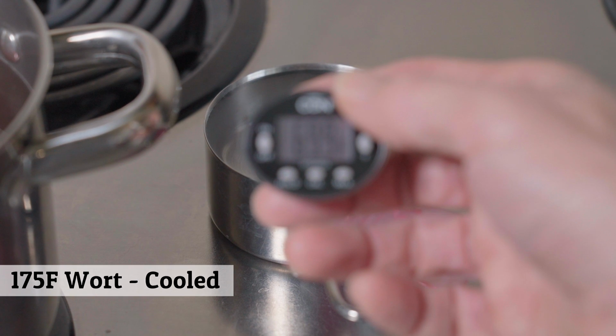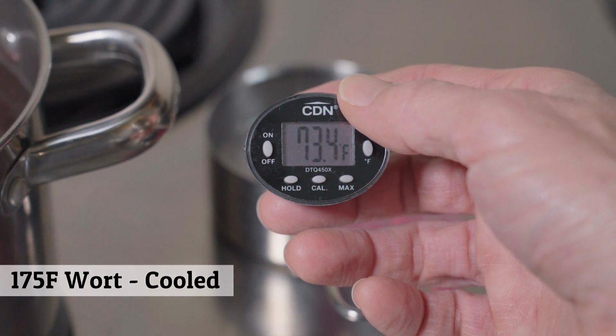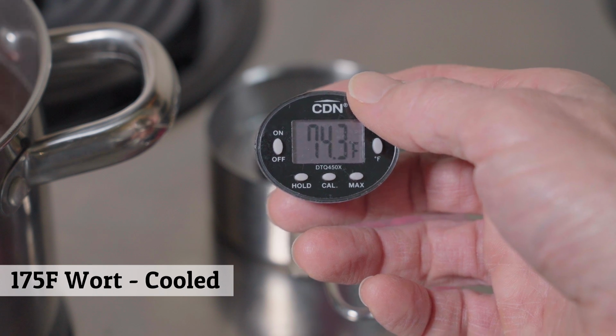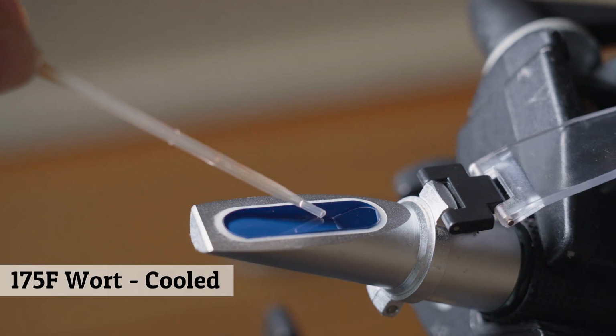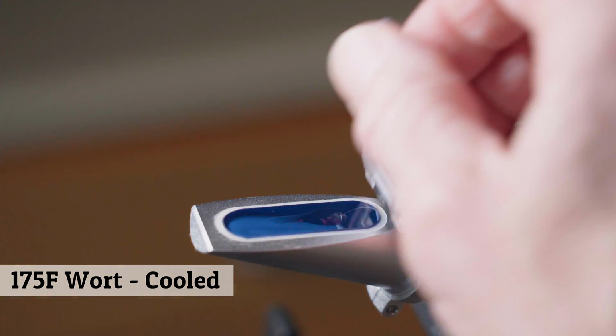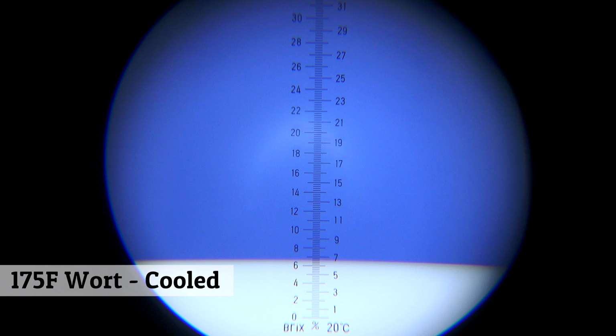Here's our 175 degree cooled wort sample. Roughly the same temperature as our original. We're going to put it on the platter, see what we get. Okay, this is kind of interesting. We've kind of started at a higher point. We're up to about 6.8, I would say. So in this instance, cooling the sample actually resulted in a little less accurate reading.